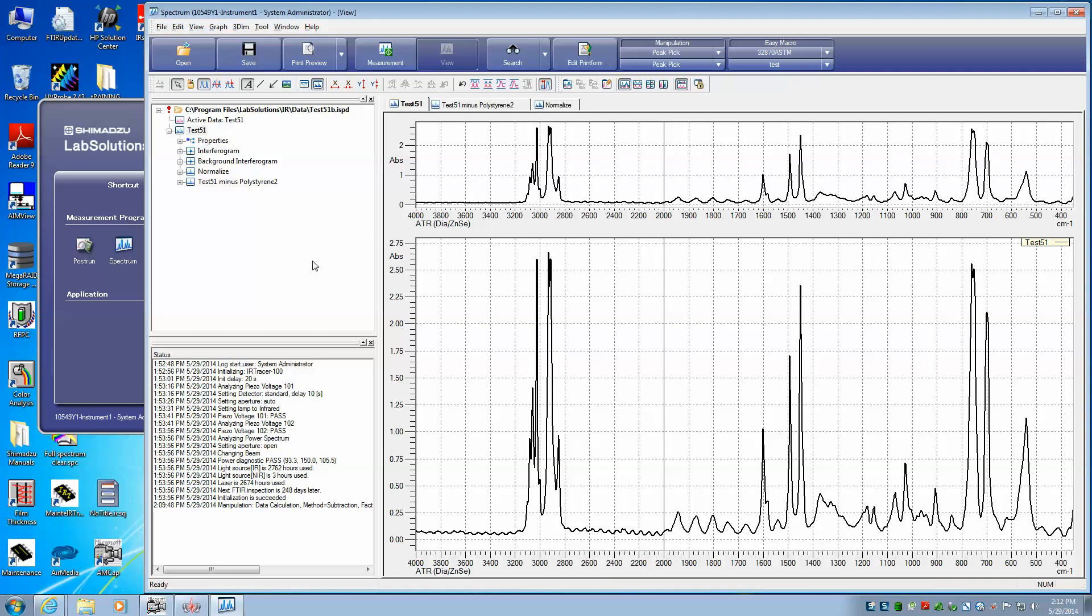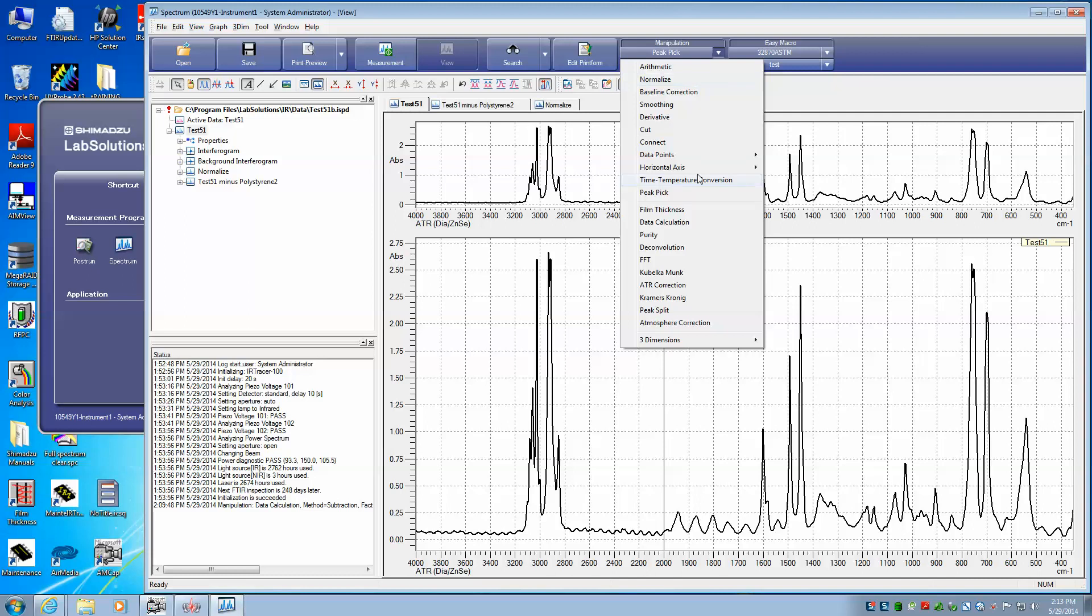Now let's say we want to do a peak pick. We want to label these peaks. We can do that by going back up here to the manipulation tabs and we'll select the one that's called peak pick.